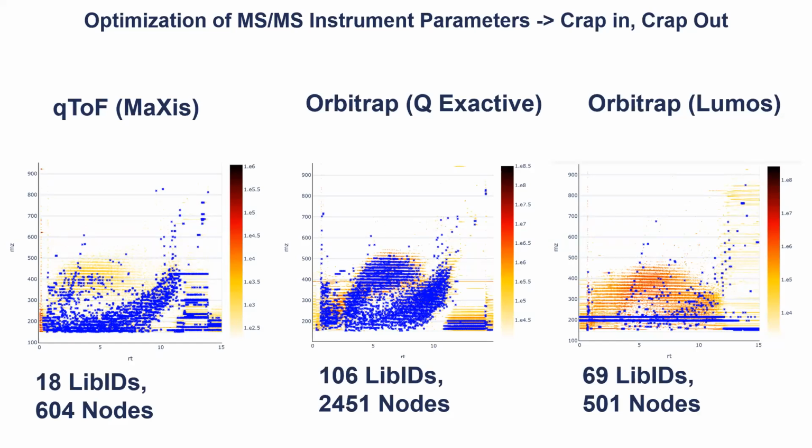Here we really want to set you up with the knowledge that when you acquire data, you set up your method correctly, because if you have bad data, then even the greatest tools that we use don't help too much.